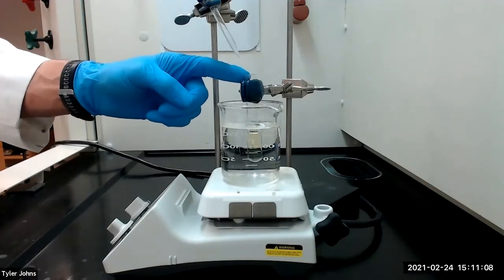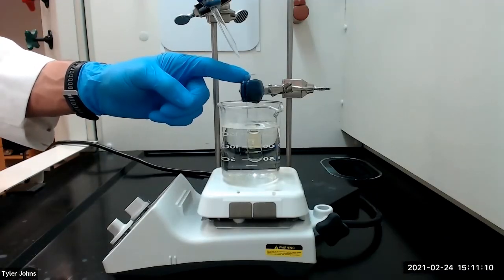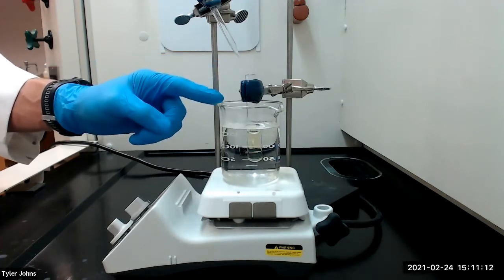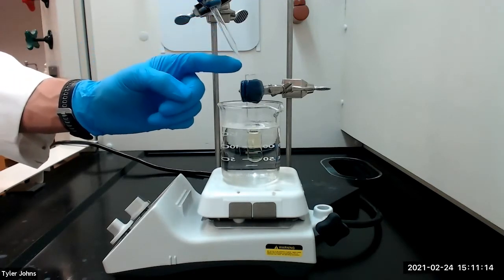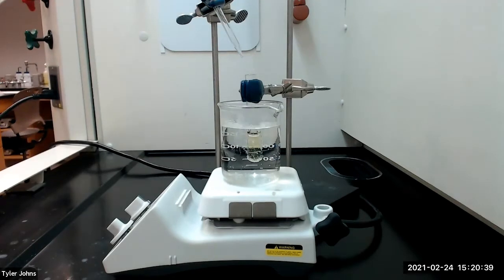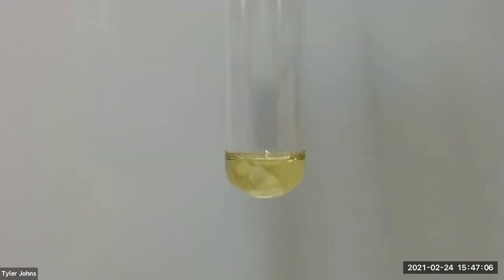We will next evaporate the acetone solvent by carefully heating the test tube in a hot water bath while directing a stream of air into the tube. Once the acetone has evaporated, you may be left with an oily solid in the bottom of the test tube. If this is the case, you need to scratch the oily product with a spatula to induce crystallization.